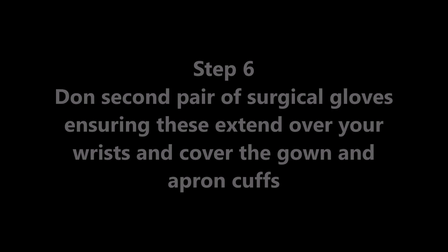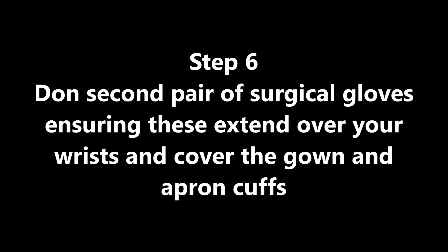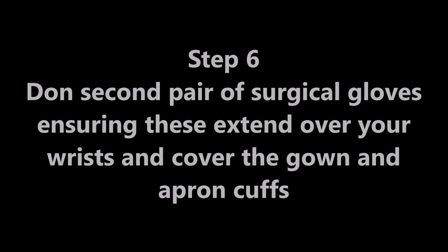Don the second pair of surgical gloves, ensuring these extend over your wrists and cover the gown and apron cuffs.